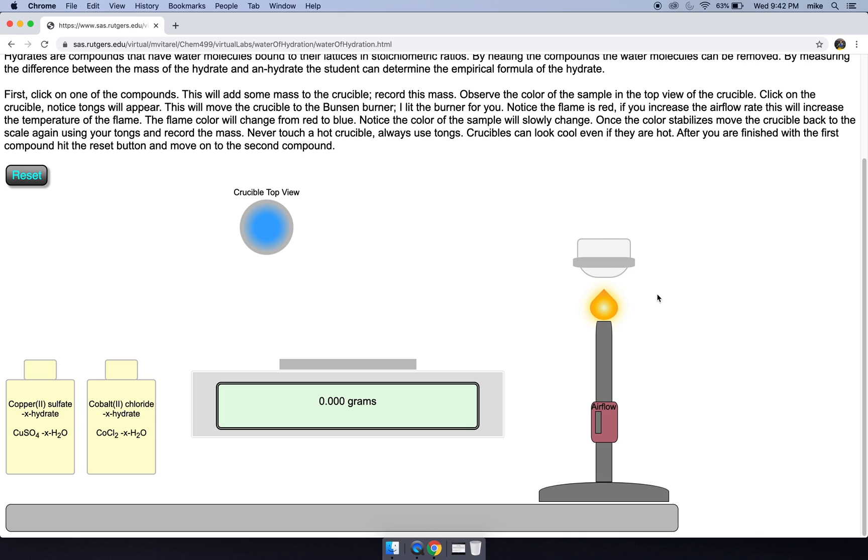So we have some options here. We can leave the flame in this reddish yellow color. However, there's two negatives with this. First, it'll take longer to desiccate our hydrate. If you notice, it's slowly changing color.